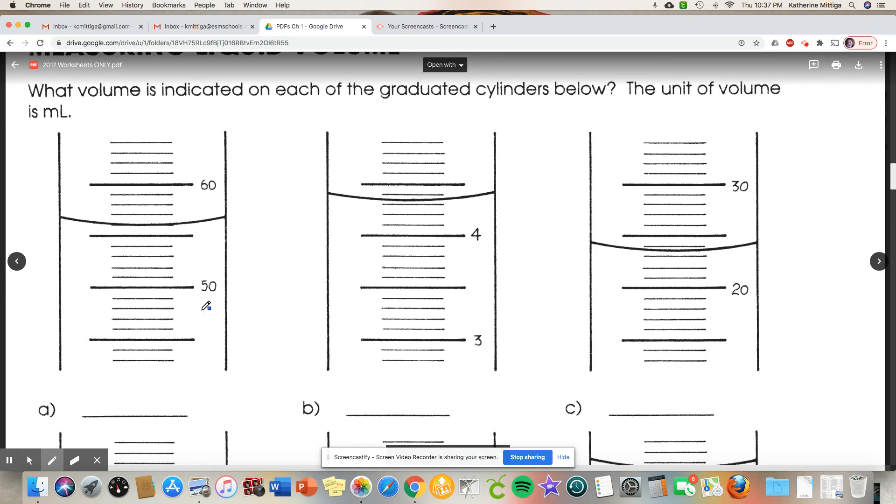First thing we need to do is figure out what the scaling is. Here's 50 and here's 60, which means each of these is worth one milliliter. So this is directly on the 56, so we know the ones, that means we have to estimate the tenths. Notice how it's directly on this line, that's the bottom of the meniscus, the curvature of the liquid. So we're going to call it 56.0 milliliters.